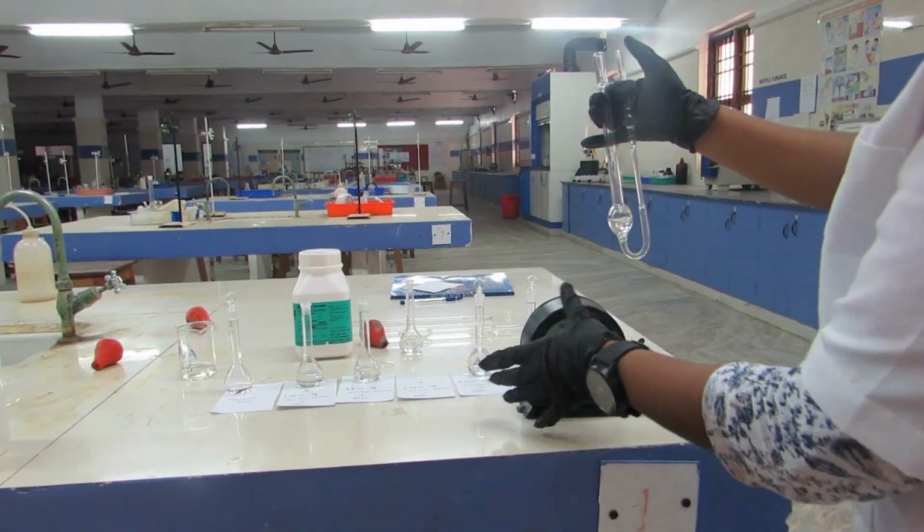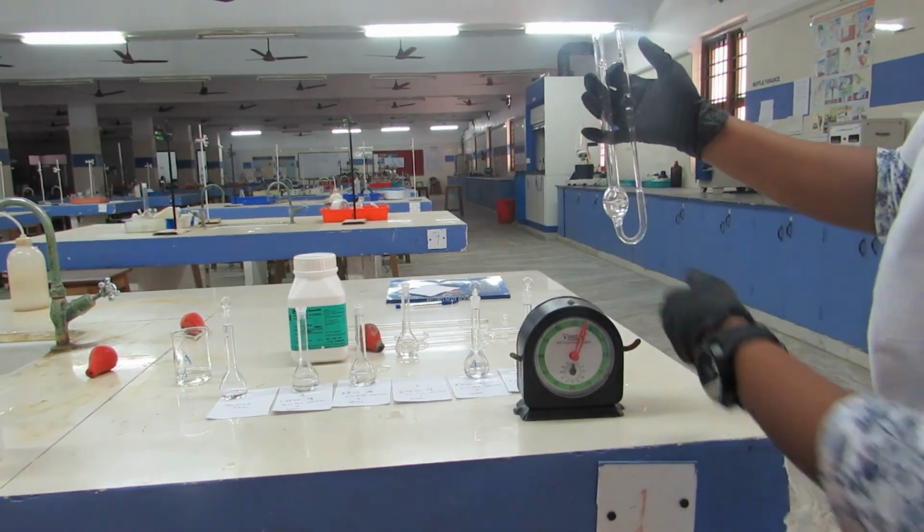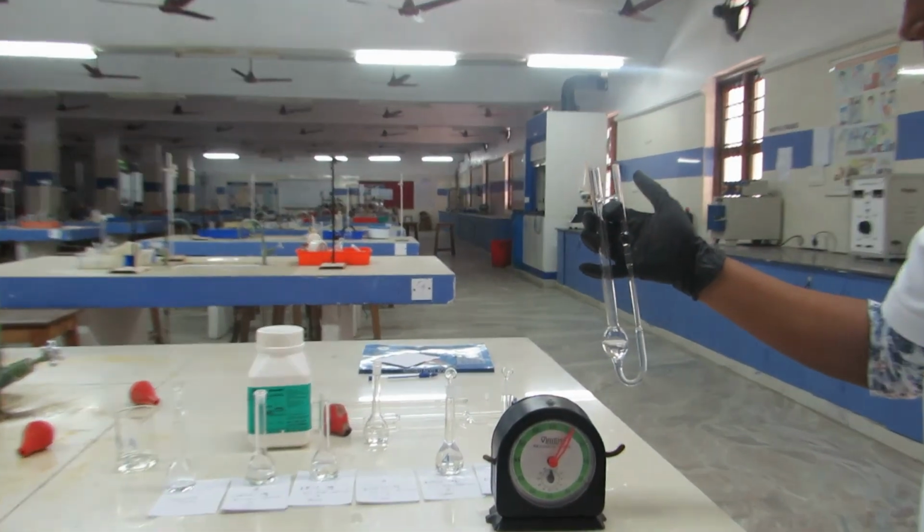You have to switch on the stopwatch as well as watch the flow, the time required for PVA to flow from this mark to this mark.